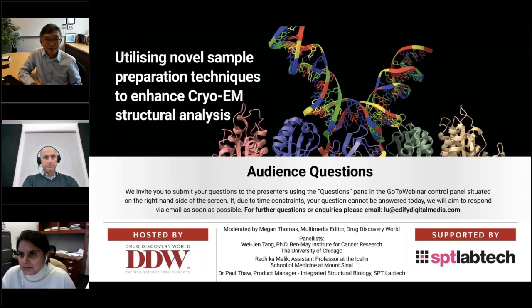So I think it's all protein dependent. Some proteins behave so well that for data collection, you have enough data, you process, it takes maybe 1 month or so, then you're on the way to look at the model and appreciate. Some will take forever.